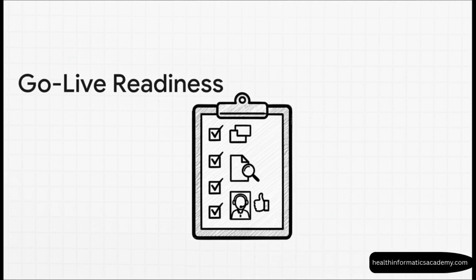So, before we flip the switch, we run through one last pre-flight check. Have the mappings been double-checked? Do the consent rules work? Are the audit logs capturing everything? Is the support team ready for day one? And, maybe most importantly, have the clinicians signed off on user acceptance testing? We don't go live until every single one of these boxes is checked.